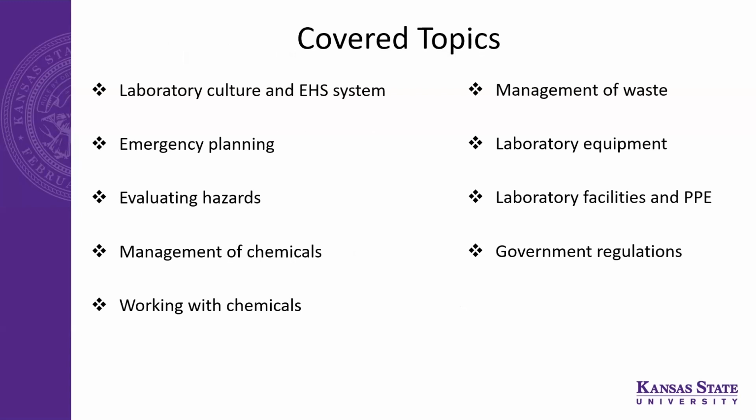These are the topics which I cover there: laboratory culture and the EHS system, emergency planning, evaluating hazards, management of chemicals, working with chemicals, management of waste, laboratory equipment, laboratory facilities and PPE, and government regulations.